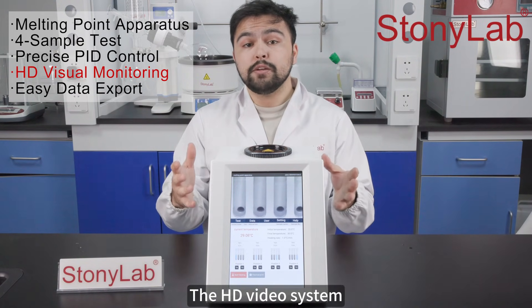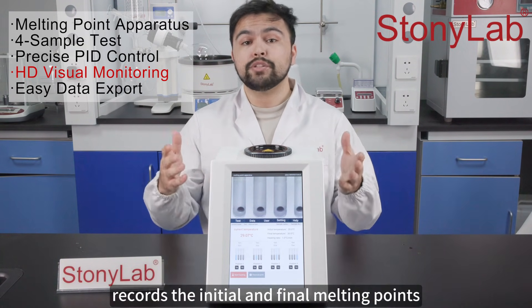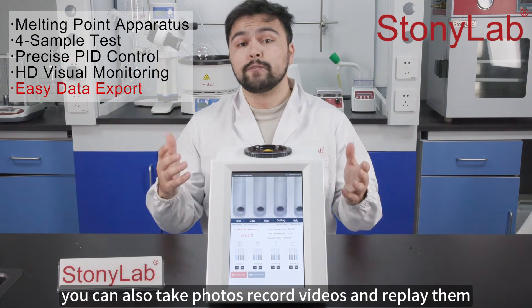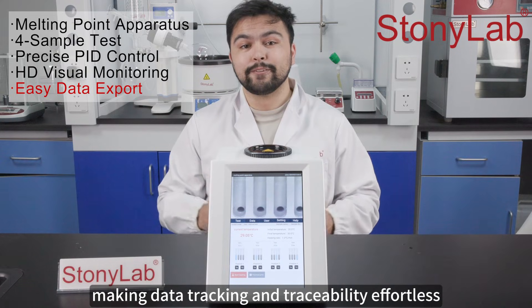The HD video system lets you clearly observe the sample melting process and automatically records the initial and final melting points. You can also take photos, record videos, and replay them with timestamps, making data tracking and traceability effortless.